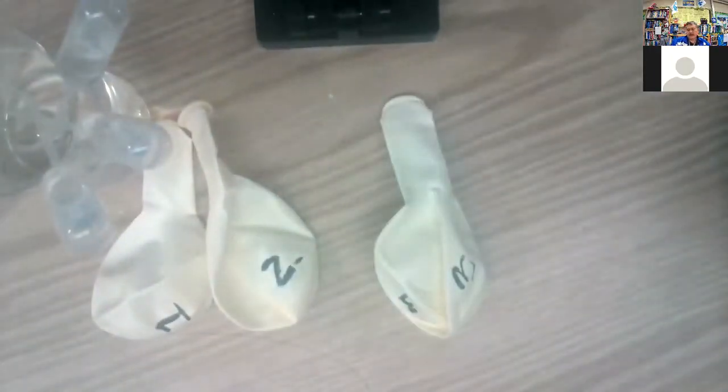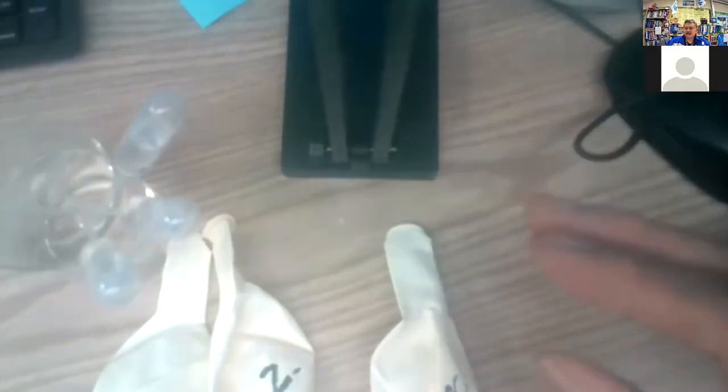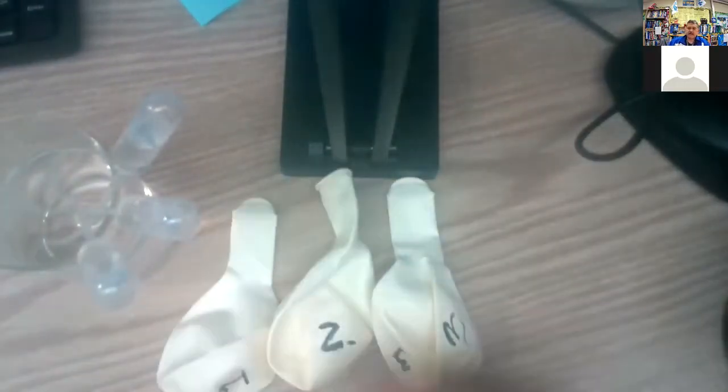I have 3 pipettes here so I can do it quicker. Once I get one going, I'm going to tie it off and we'll try to do it fairly quickly so that the times will be similar.